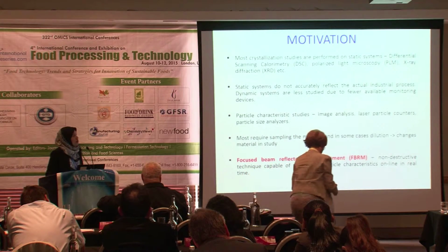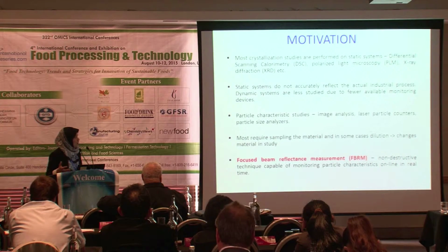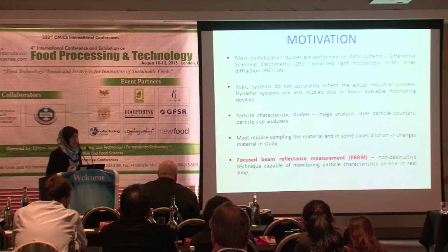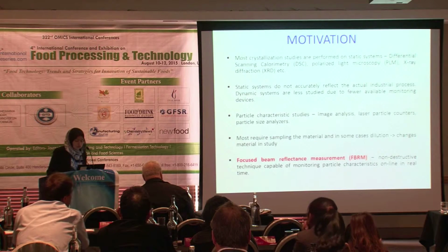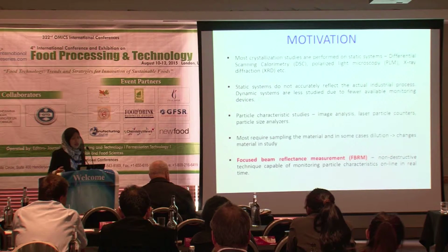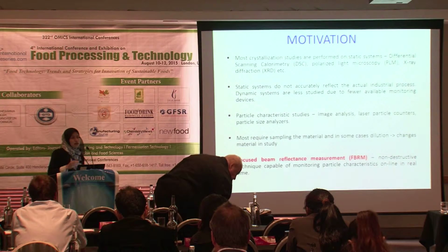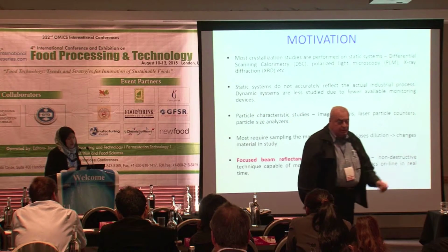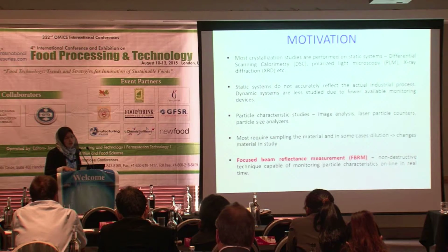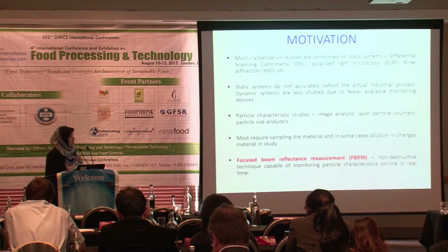This is partly due to the limited number of tools or techniques which are capable of monitoring crystallization in real time. Also, previous particle studies have focused on using image analysis, laser particle counters, and particle analyzers. However, some of these require sampling the oil during the study, and in some cases, we need to dilute the samples, and this causes changes in the material and is not an accurate representation of the actual conditions within the vessel.